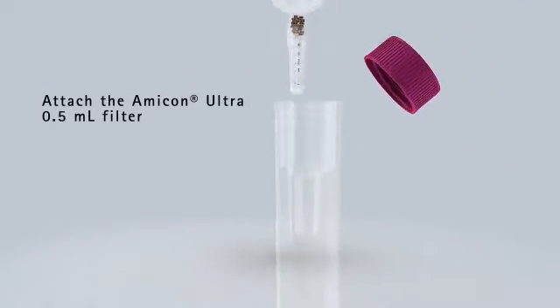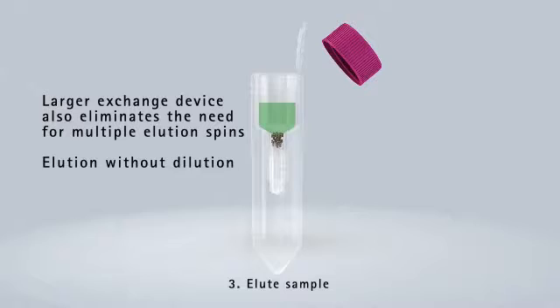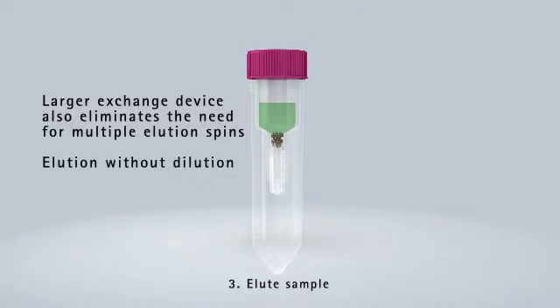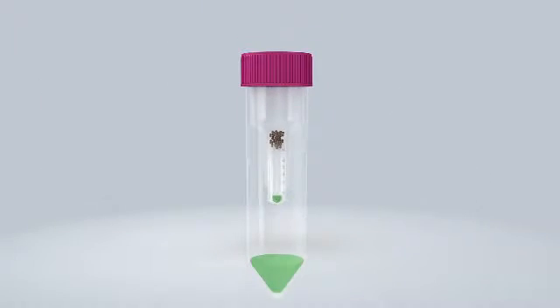Attach the included Amicon Ultra 0.5 milliliter filter to the exchange device. Attaching the included Amicon Ultra 0.5 milliliter filter during the elution phase provides simultaneous concentration as the sample is eluted from the resin.